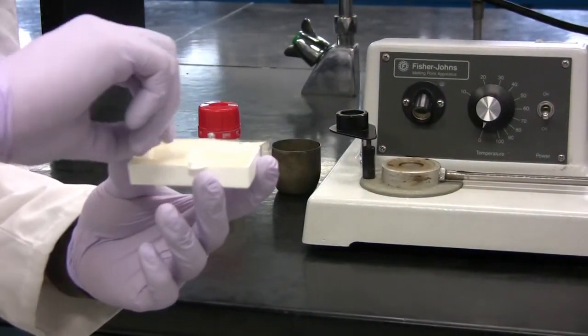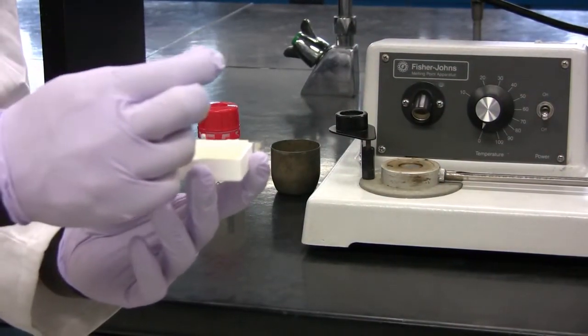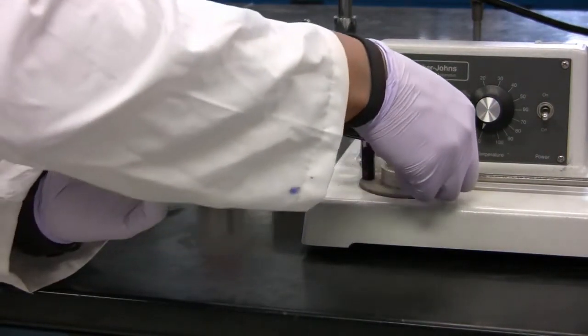Start by placing a cover slip onto the heating element. Make sure the temperature is off.